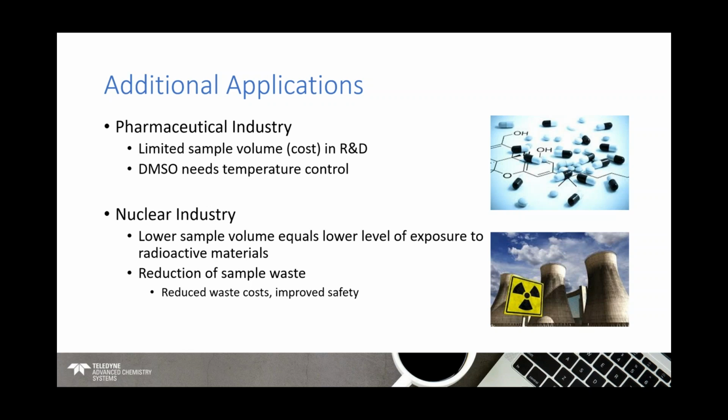So you could use the MVX to work with less sample if you're using DMSO as a solvent, and you could control the temperature prior to sample introduction, hold it at about 30 degrees C for the sake of argument, and that way you're going to make sure that your sample goes through into your nebulizer, doesn't solidify, and it ensures the robustness of your analysis.